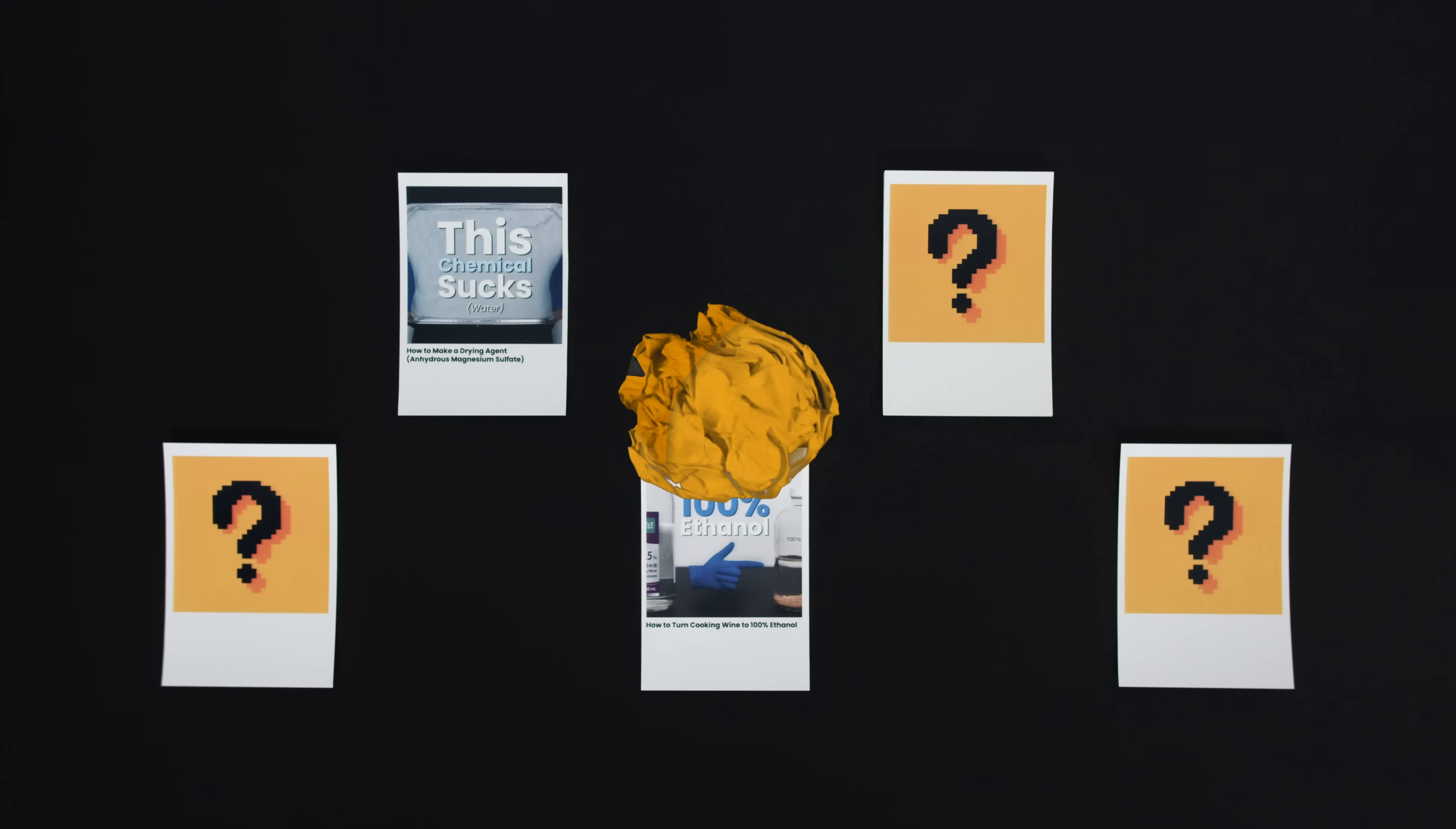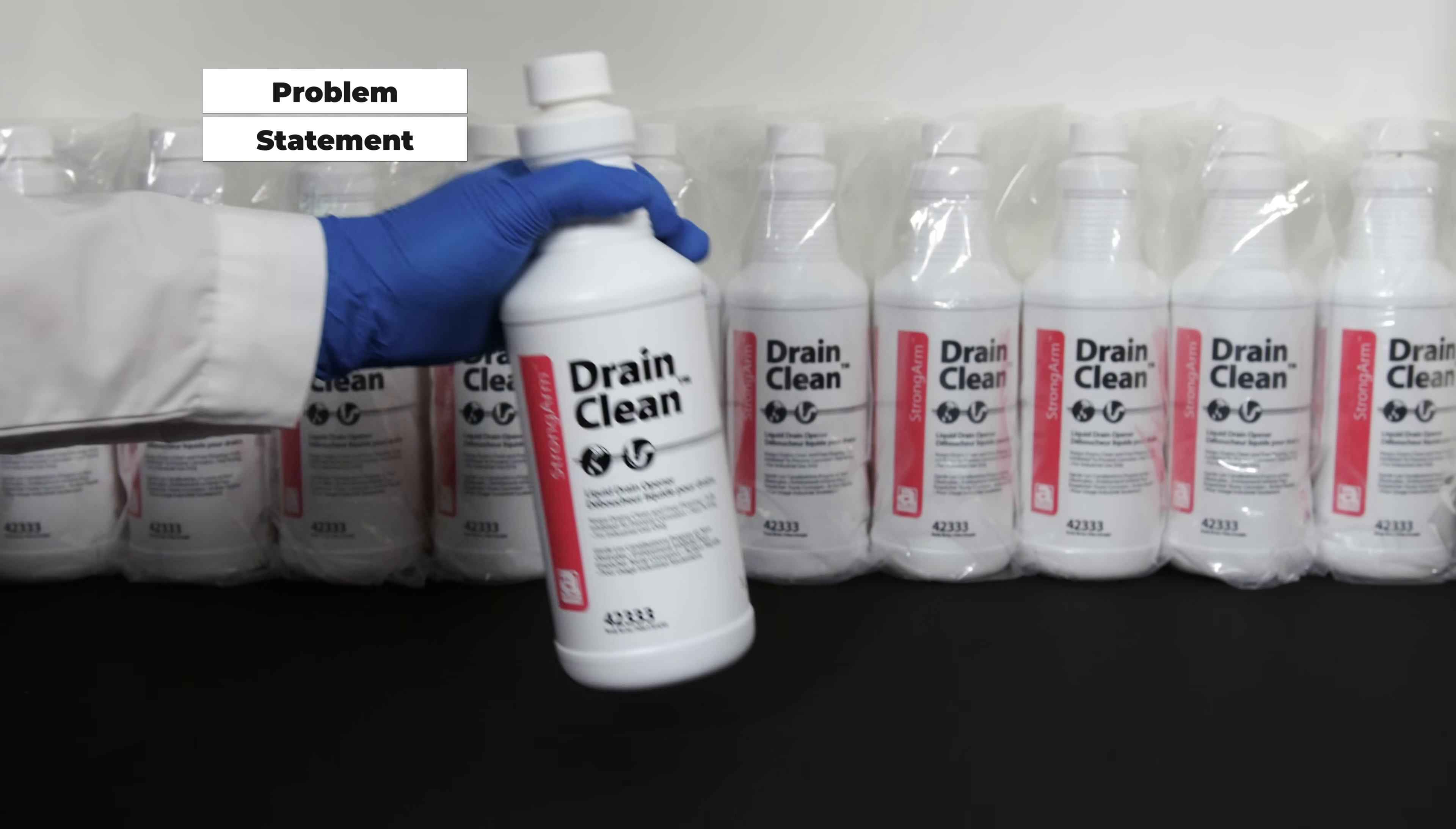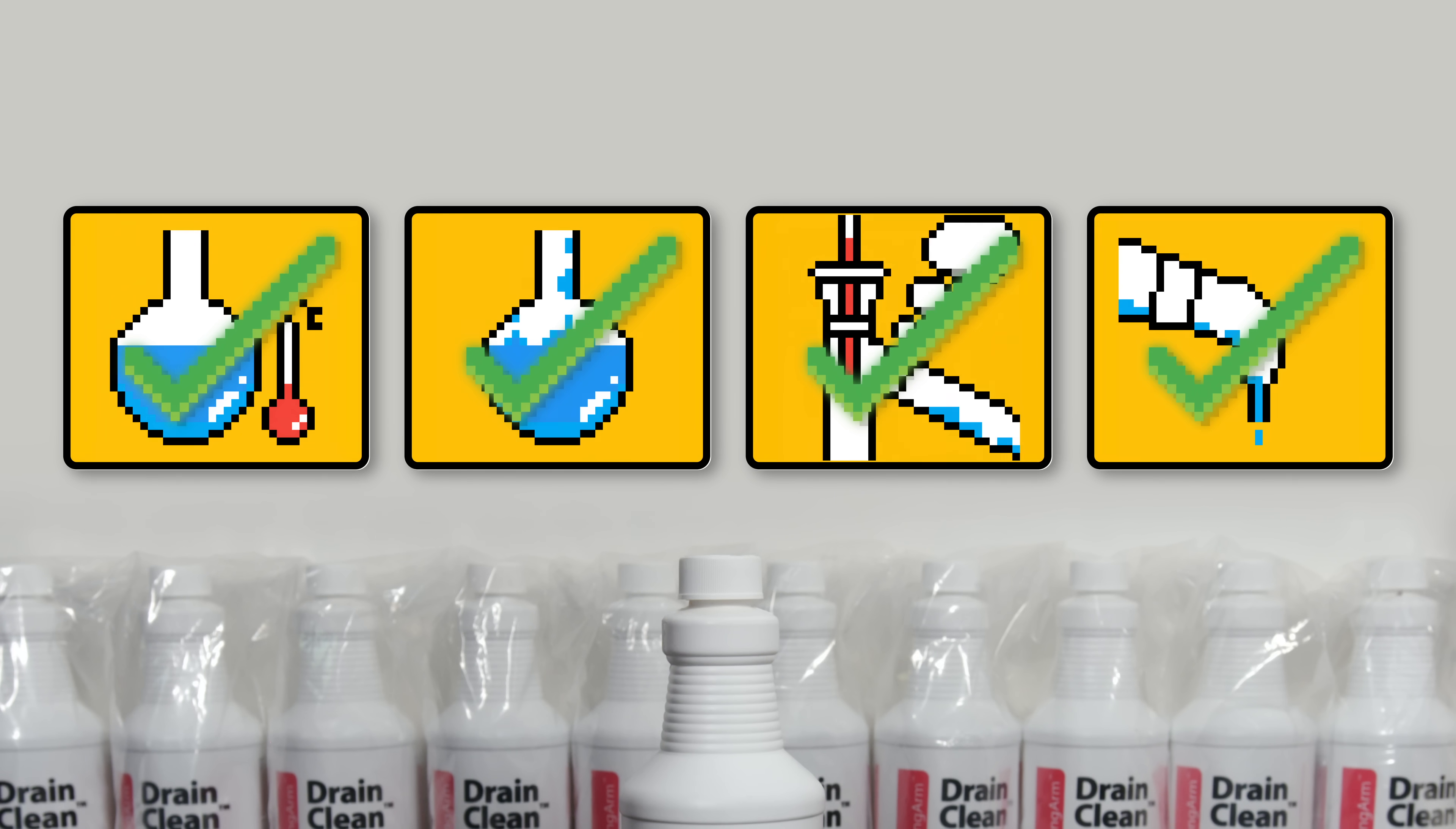Welcome back to part 4 of the OTC chemical series, and today we are distilling concentrated sulfuric acid. Concentrated sulfuric acid is an extremely useful reagent that can be found in some drain cleaners. However, the distillation may not be as straightforward as you might think. I have been fine-tuning this process on and off for 9 years.